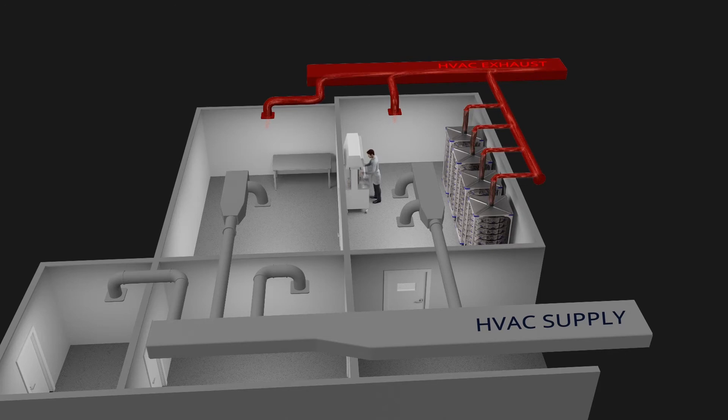Each rack is connected by hoses to the building's exhaust system through connectors or ceiling drops.